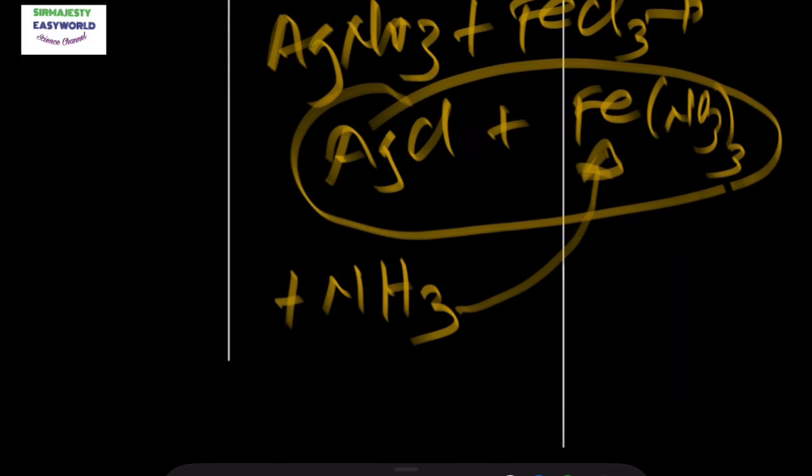So it's going to be a confusing experiment. If they ask that question, a child is free to say, on adding silver nitrate, there is formation of white precipitate suspended in brown solution of iron 3. Then on adding aqueous ammonia, instead of saying it dissolves in excess, you now say reddish brown precipitate formed, because that is the experiment. I am an analyst. Practically, this is what you will obtain, because I have done them before giving you this guide.